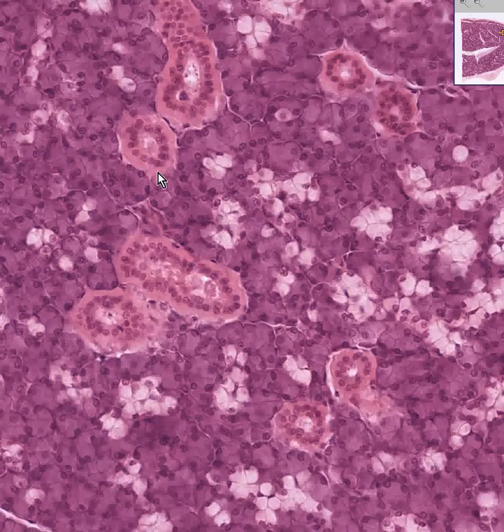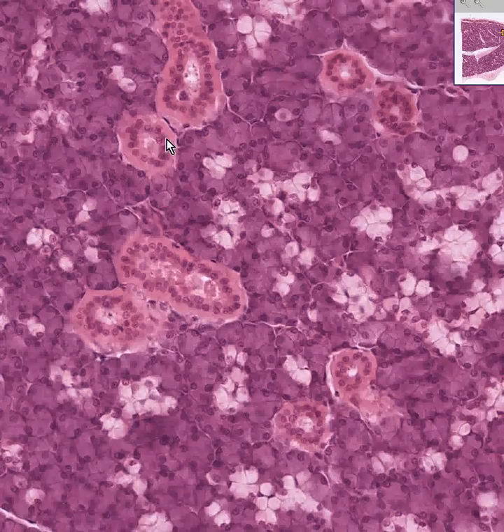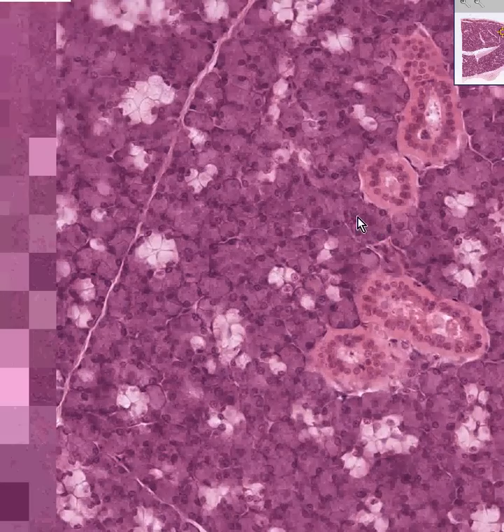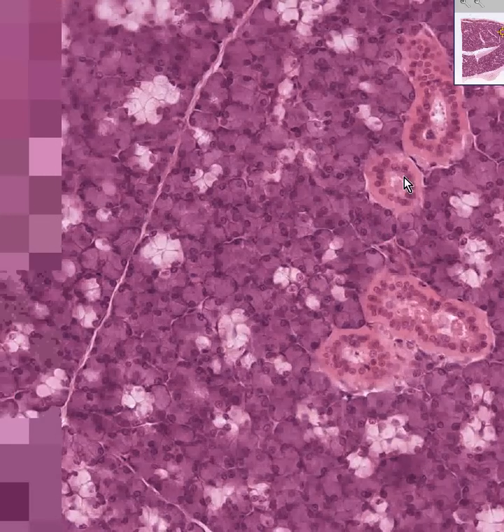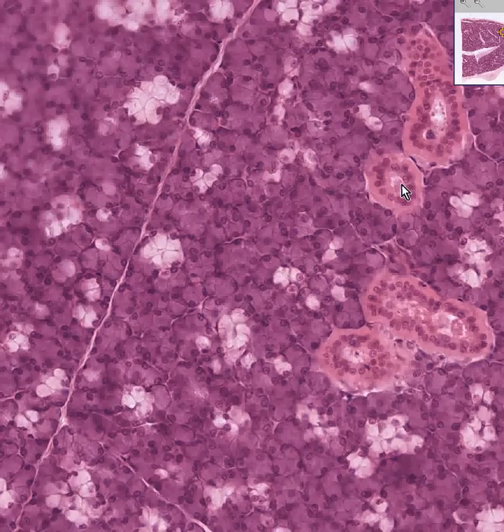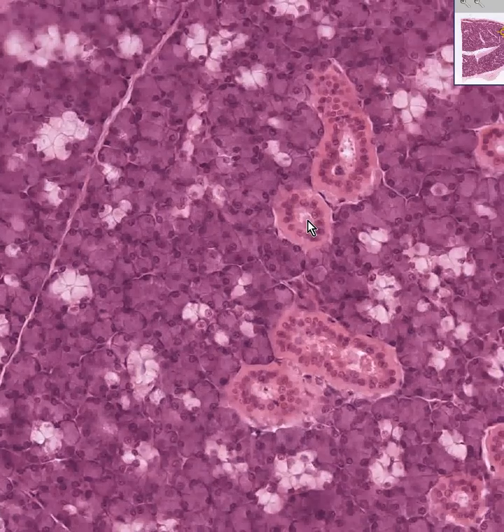Like the parotid gland, you can also see that there are a lot of intralobular ducts, which have bright red, slightly striated cytoplasm — you can see slight little lines — so these are the intralobular striated ducts. If you looked around with a little more patience, you would see another type of intralobular duct which does not have this bright red cytoplasm but less cytoplasm, which would be an intercalated duct.